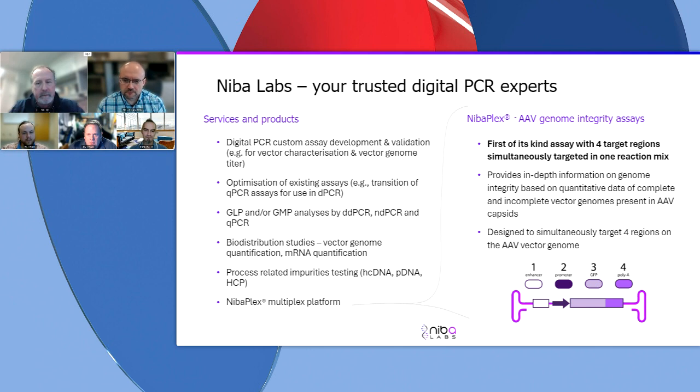Question to Rob real quick. So I was just curious, we have just gotten started on the sequencing side of things. Have you seen any type of systematic errors in long read or short read sequencing that still need to be ironed out before that becomes more of a pipeline?